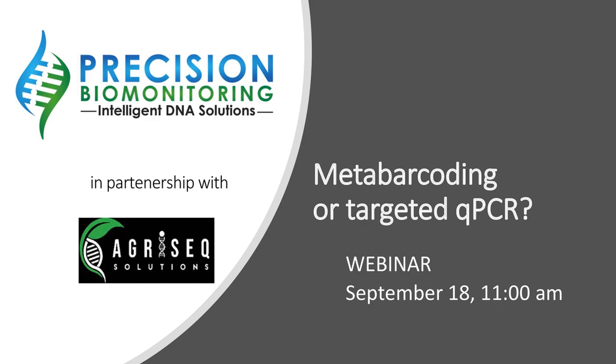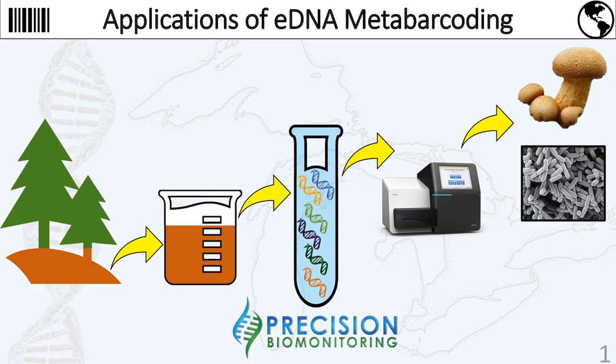Steve. Thanks, Mario, and good day, everybody. In the following section, we shall discuss how eDNA metabarcoding may be applied in an ecological context to better assist clients in their compliance monitoring of biodiversity. In so doing, we shall briefly touch on the difference between targeted single or few species approaches and large-scale horizon scanning surveys of entire biotic communities, as facilitated by metabarcoding.